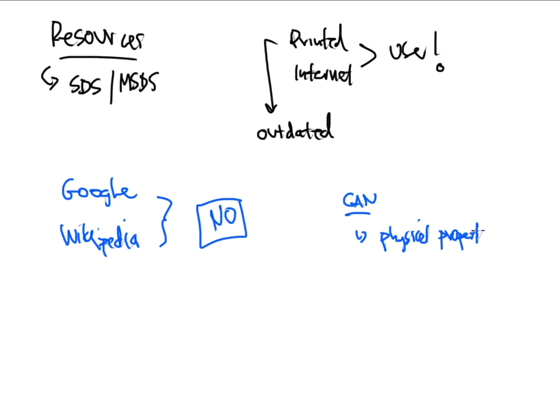All right, so what would be physical properties? This would be something like boiling points or melting points, maybe density, formula weights of compounds. All of these things you're going to learn in a general wet laboratory course or an entry-level chemistry class. All of that information is verified.